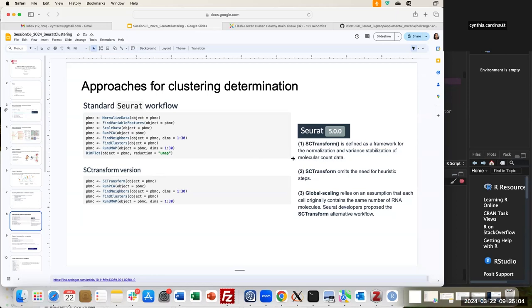An important highlight: SCTransform is only available in Seurat version 5. It is defined by the developers as a framework for normalization and variance stabilization embedded within the function. Another motivation for SCTransform is that the global scaling in the standard approach assumes each cell originally contains the same number of RNA molecules. SCTransform offers an alternative that does not rely on this assumption.